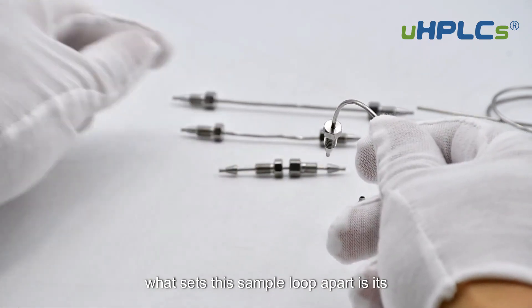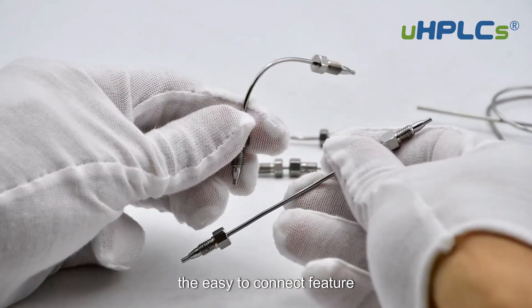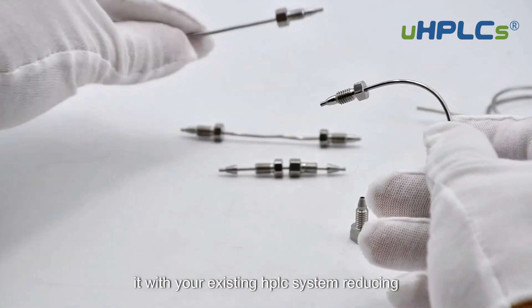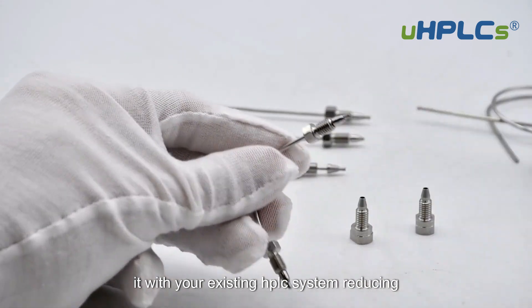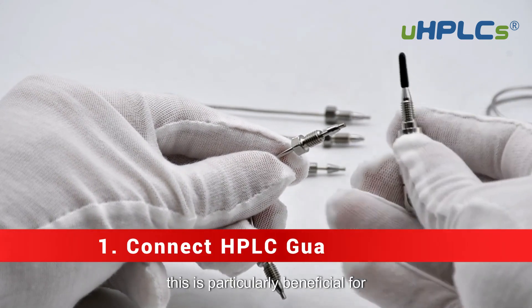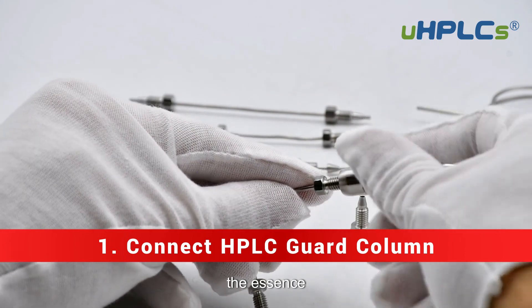What sets this sample loop apart is its user-friendly design. The easy-to-connect feature ensures that you can seamlessly integrate it with your existing HPLC system, reducing setup time and minimising the risk of errors. This is particularly beneficial for laboratories where time and accuracy are of the essence.